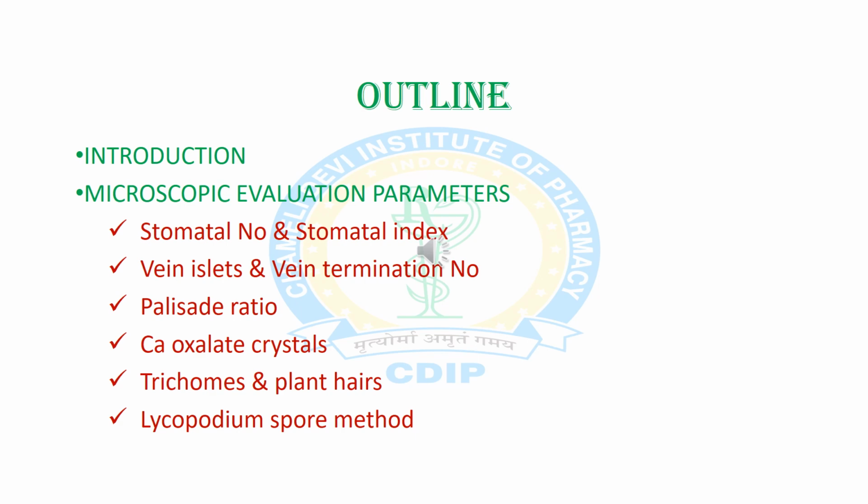First is stomatal number and stomatal index. Second is vein islet and vein termination number. Third is Palisade ratio. Next is calcium oxalate crystals, trichomes and plant hairs, and last one is Lycopodium spore method.